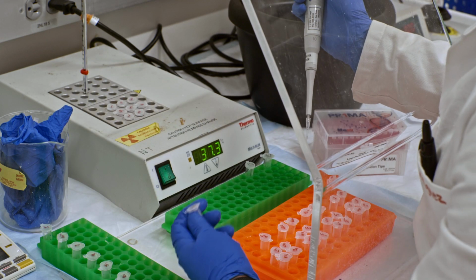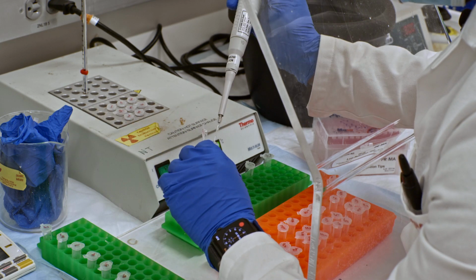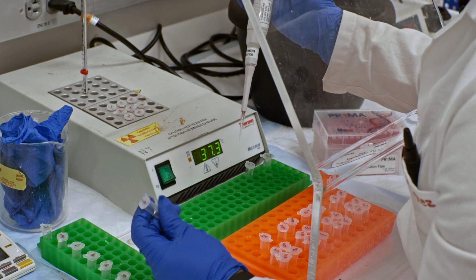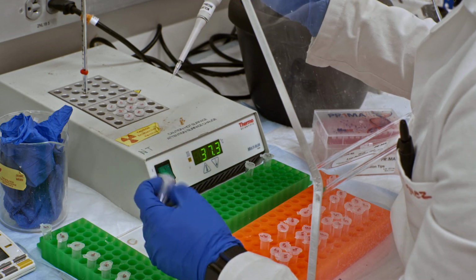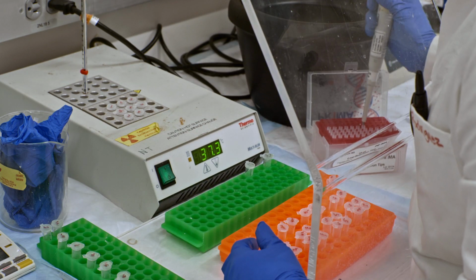Then I get the sample that corresponds to that time point. So 1, 2, is 5 minutes for me. Now, I'm gonna place my sample directly above it until I hit the time point, which is now. And I add my sample in here, briefly stir it, and make sure that almost all of it is gone out of my pipette tip so I can have maximum sample size.